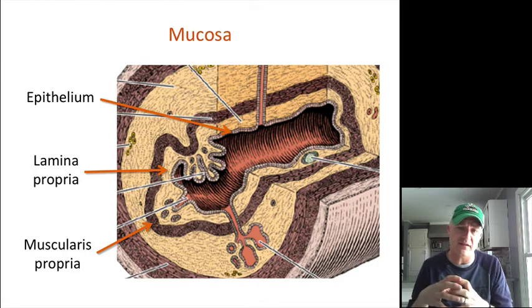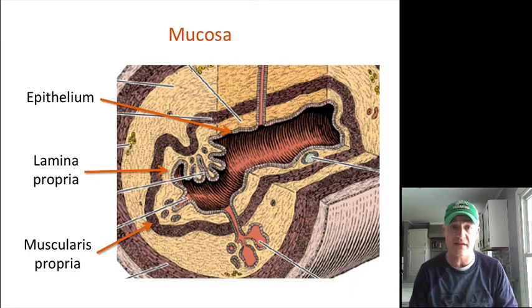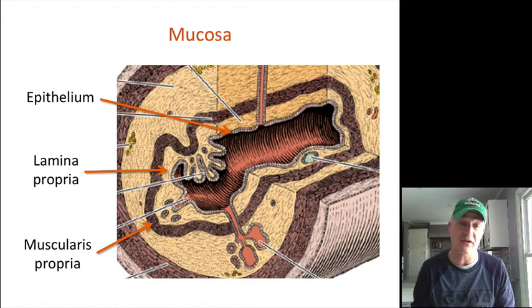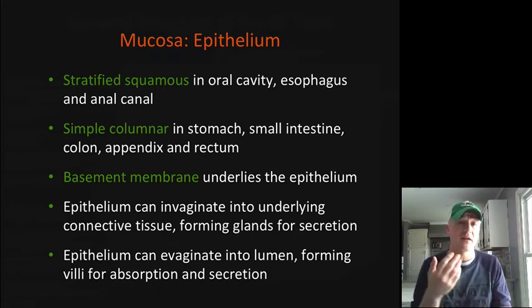And again, this is just a little bit of smooth muscle that can tension that lumen a little bit. You can see beneath that, we're going to have a much thicker layer, that muscularis layer, which has 2 different orientations to the muscle on top of being a much thicker layer. So again, depending on where we're at, it's going to depend, and it has to do with what these tissues are doing. We talked about this when we talked about epithelium. Certain epitheliums are going to be good at certain things.